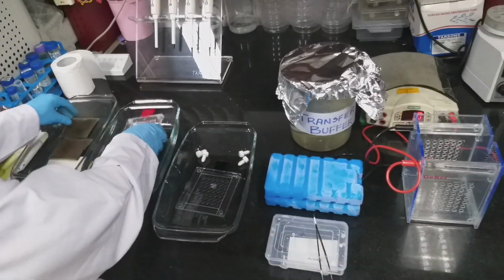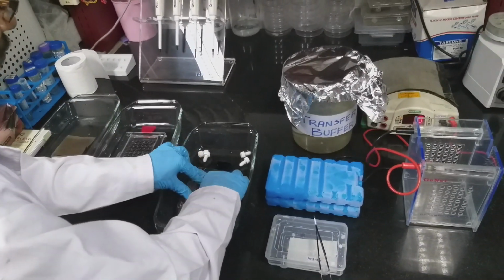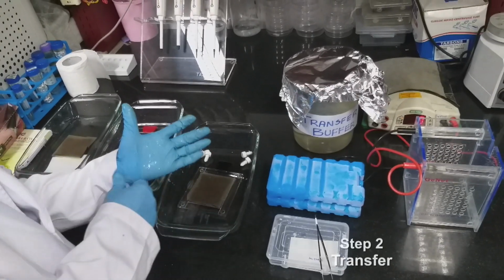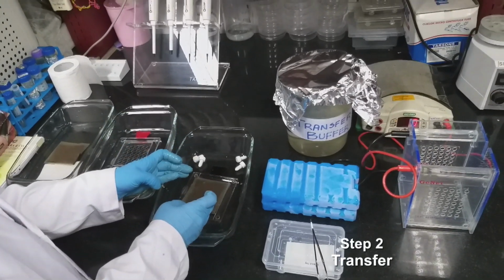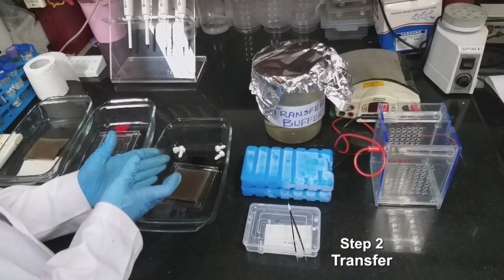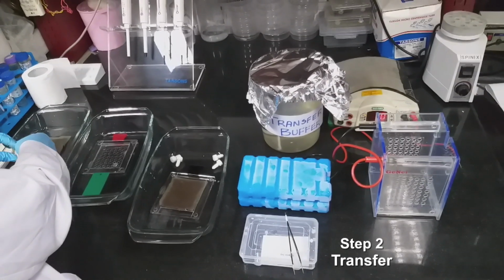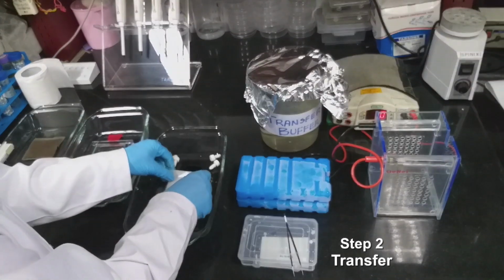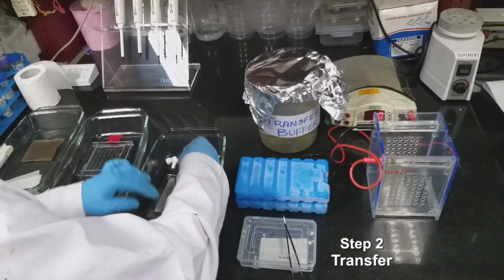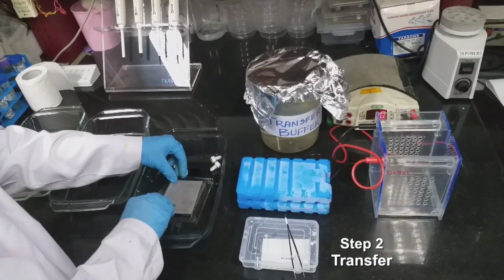First, these sponges we need to keep, and they may give some non-specific binding to the membrane. So we put blotting sheets on top of this. After this you have to remove air bubbles, if any are present.